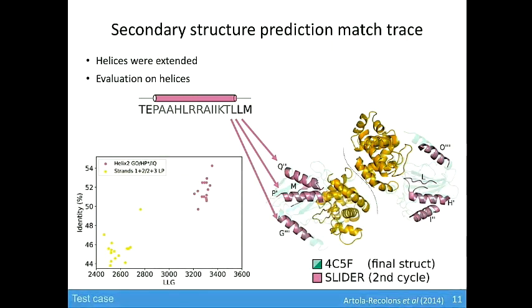Here it's important to highlight that the NCS, the non-crystallographic symmetry, present in this C-terminal domain is different from the N-terminal domain. So when we were doing the trace, we couldn't input this restriction in the trace. That's because the hinge between the domains in the first monomer and the second was different. So in this case, we already input the NCS while generating the hypothesis.